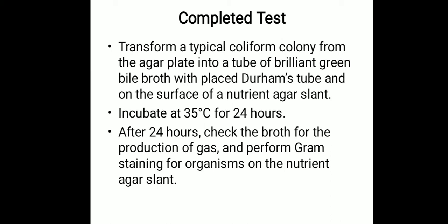Then they are incubated at 35 degrees Celsius for 24 hours. After 24 hours, the broth is checked for the production of gas and a gram stain is made from organisms on the nutrient agar slant. If the organism is a gram-negative non-spore-forming rod and produces gas in the lactose tube, then it is positive that coliforms are present in the water sample. So that is for the completed test.